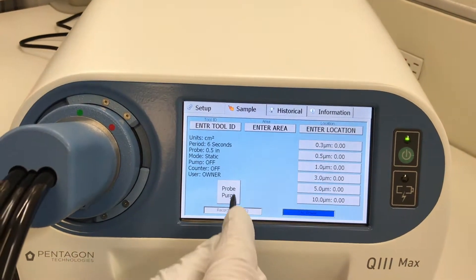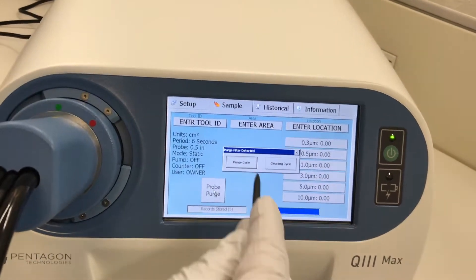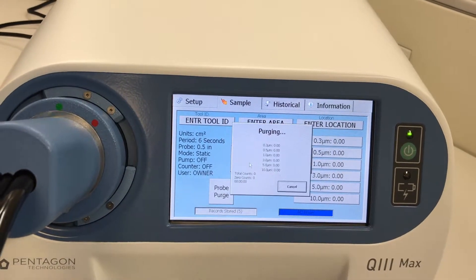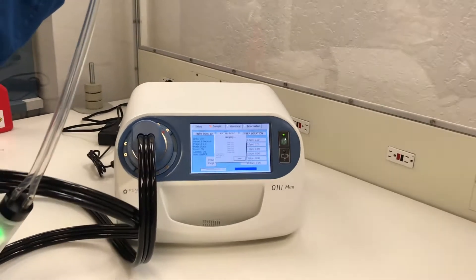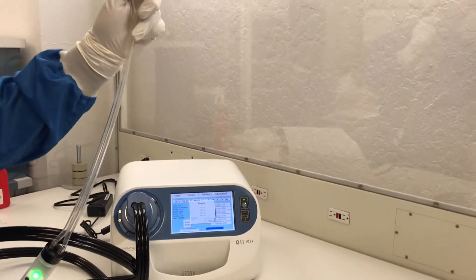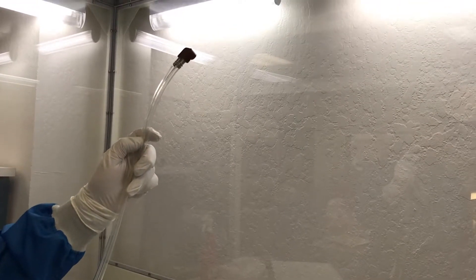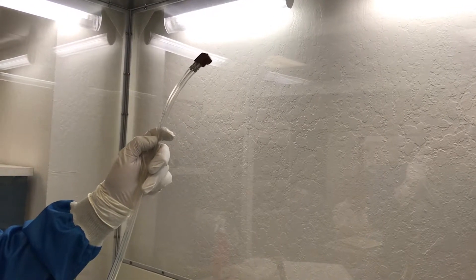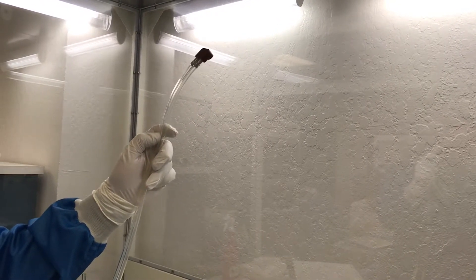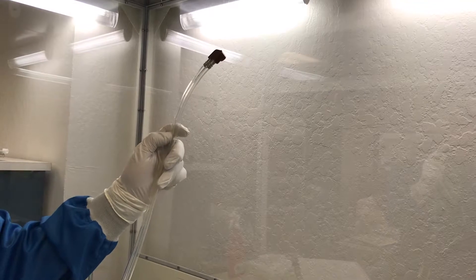Now we are on the sample page and we are going to purge the probe to ensure that the probe and system do not contribute any counts to our test results. The purge process measures the air above our part and continues to run until it gets five successive zero counts. Notice how the probe is held close to the clean air coming from the HEPA filters.